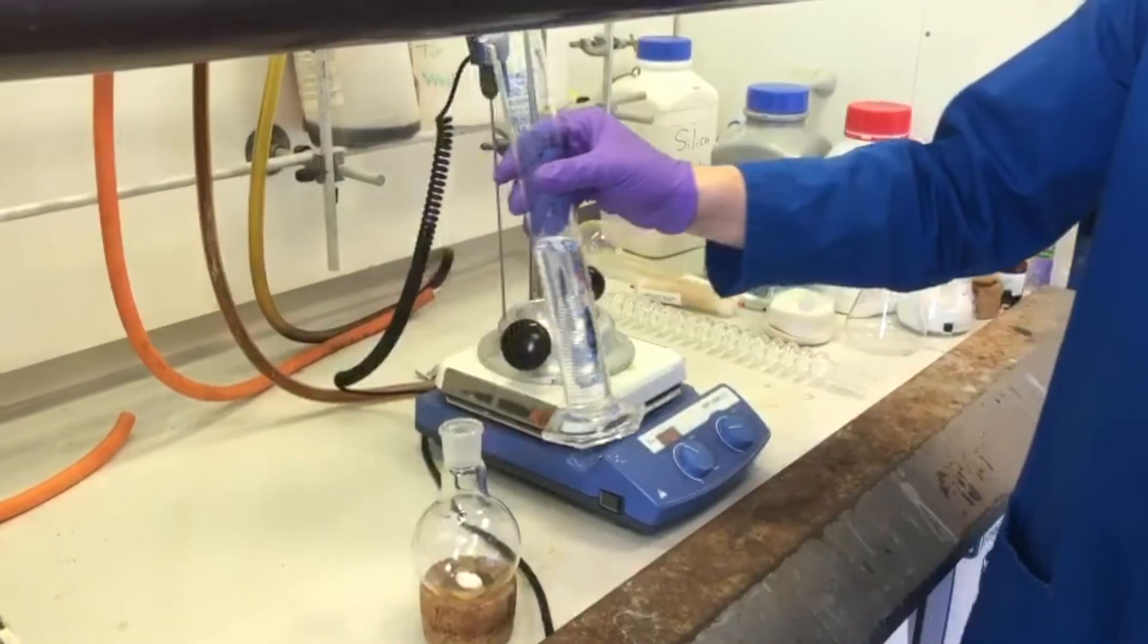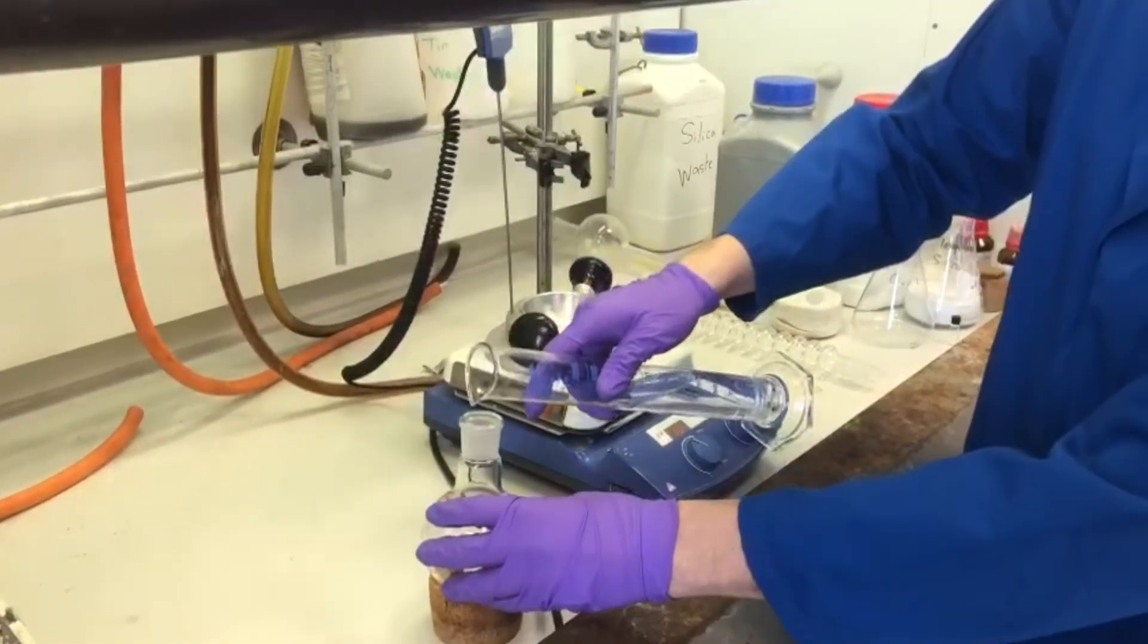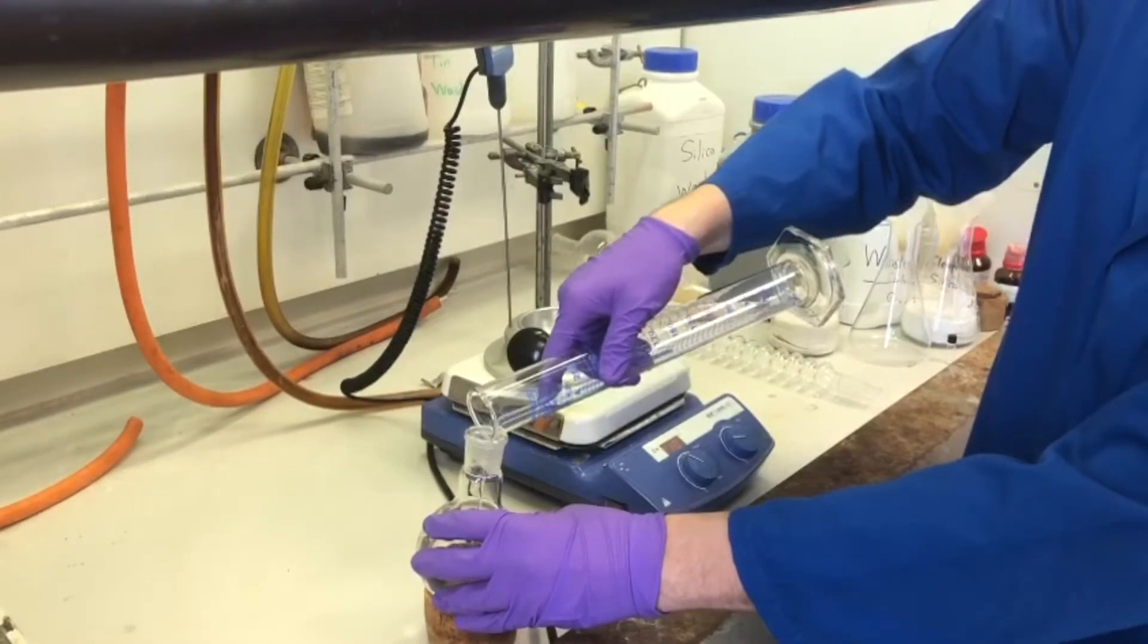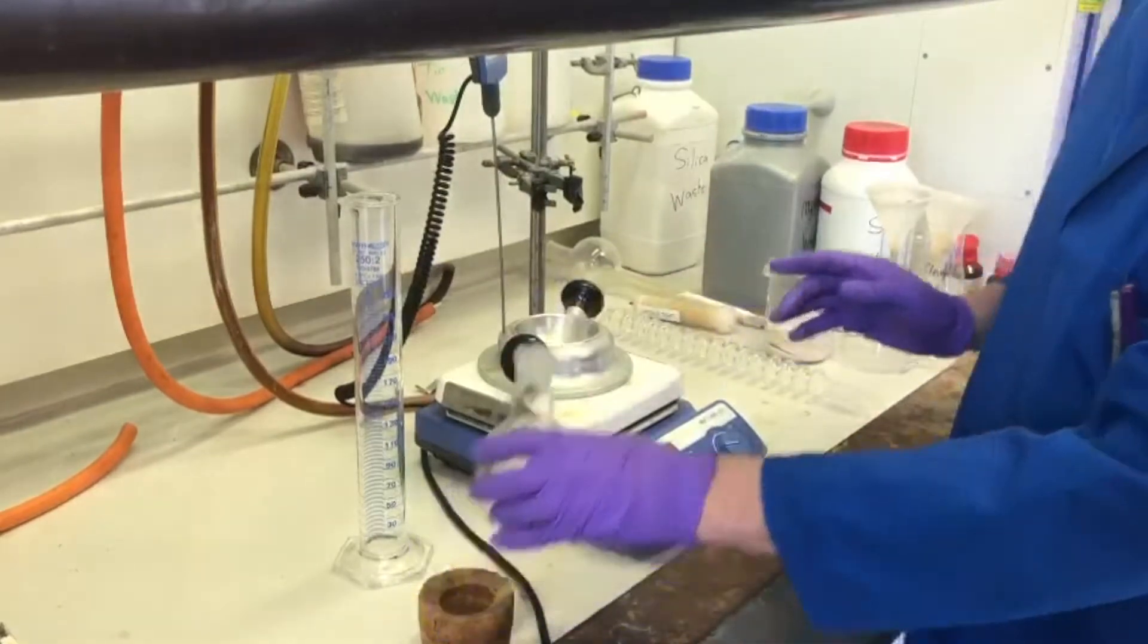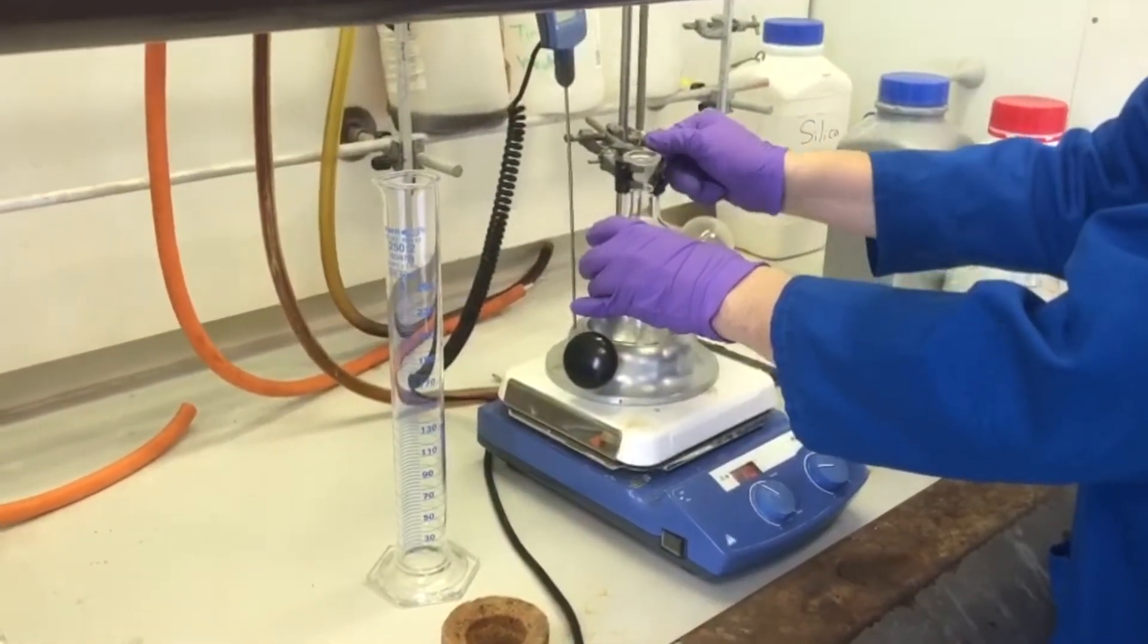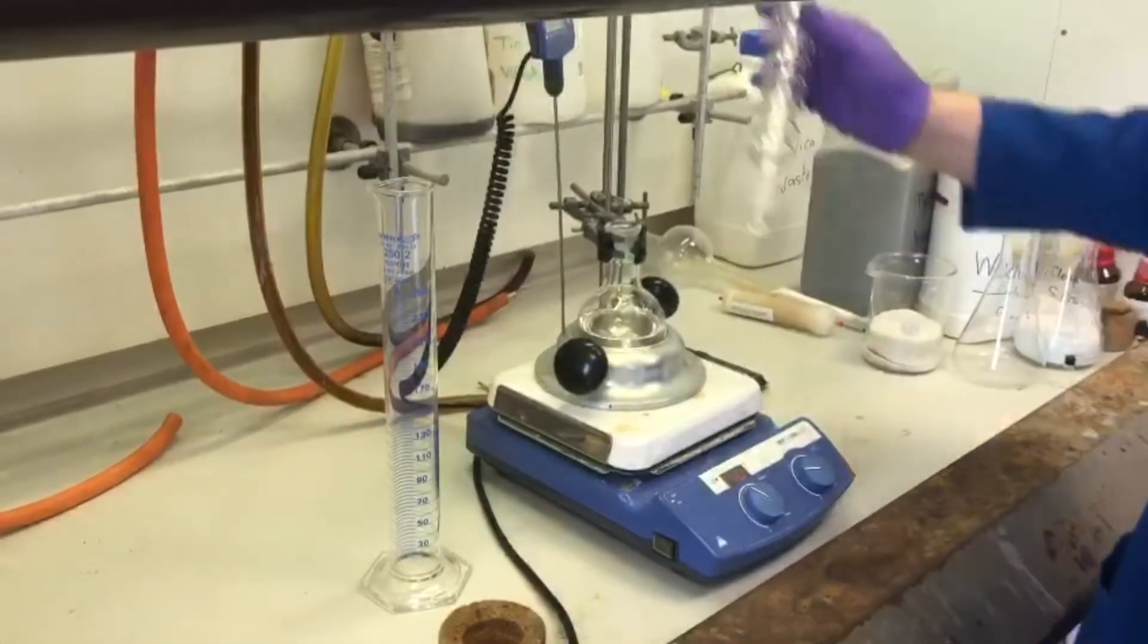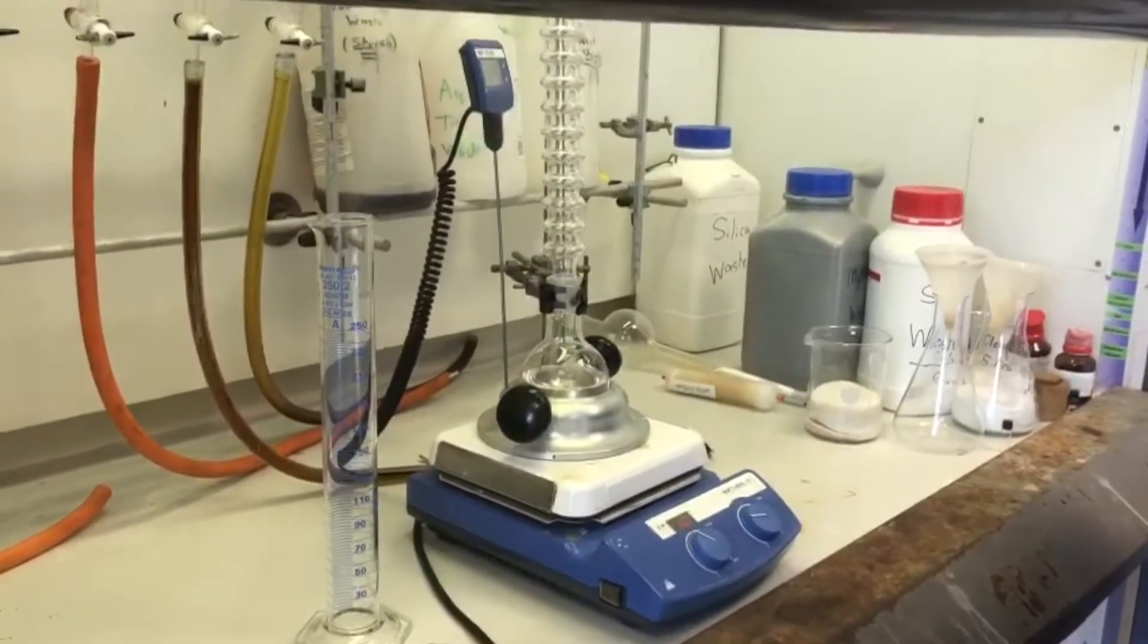And we'll then add our mixture of sec-butanol toluene, which we've pre-measured in a 4 to 1 ratio. Clamp it up, and we'll fit the dry condenser in this case. Leave it to warm up and reflux for an hour and a half.